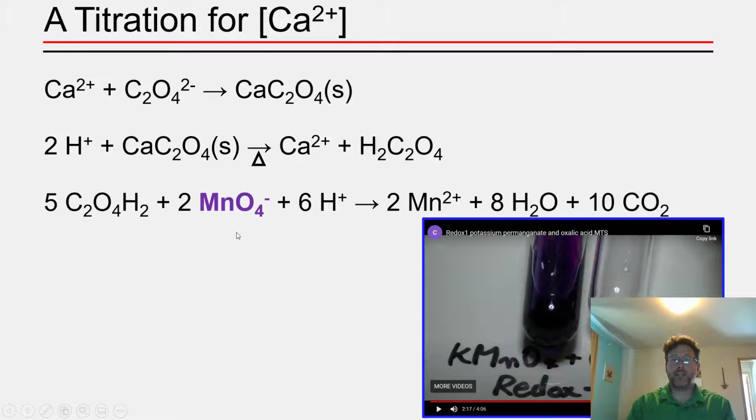And the key aspect here, which makes the titration very feasible, is that you don't actually need a separate indicator because the permanganate is highly colored. It's a very bright purple. And so initially the titration starts out clear colorless because every mole of permanganate that you titrate into the oxalic acid solution reacts and you form a clear colorless solution because manganese 2 ion has no color.